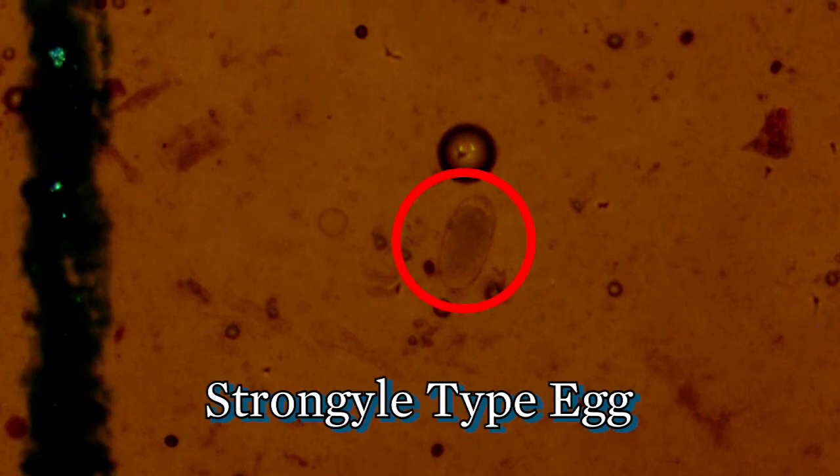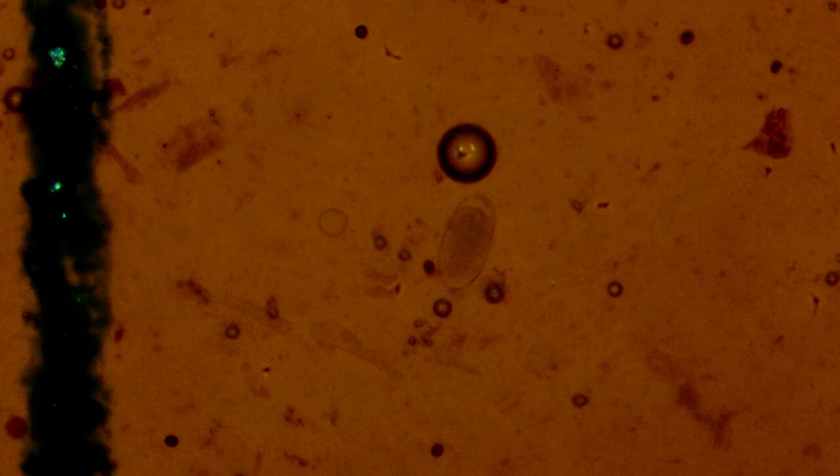And you're going to start scrolling up or down in the column until you come across a strongyle-type egg as we see here in the middle. Now again, this is strongyle-type or gin and this is primarily what we're going to be looking for.